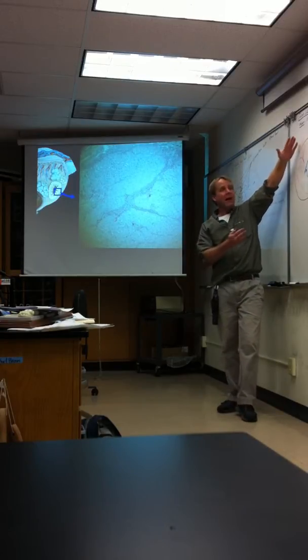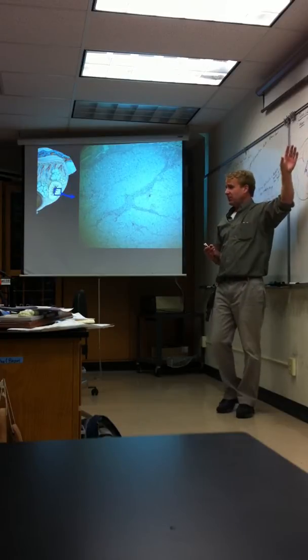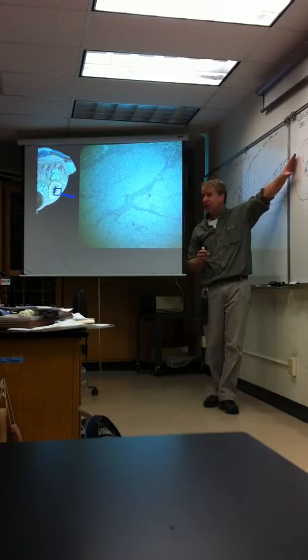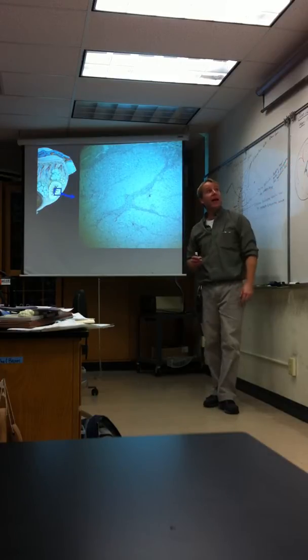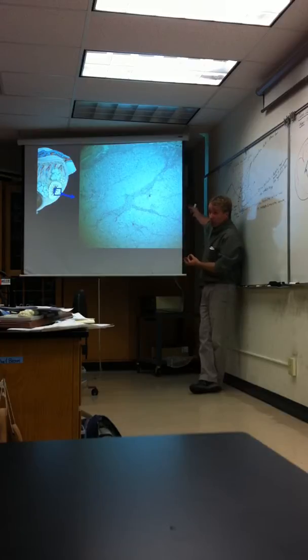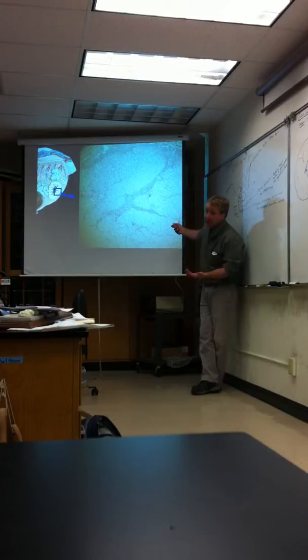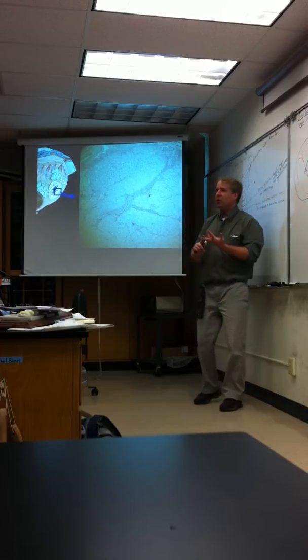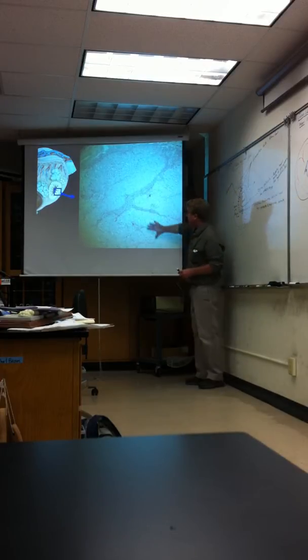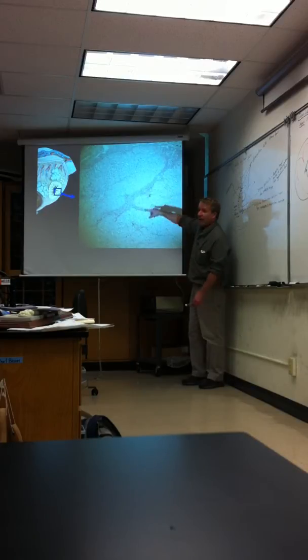With a model or with a microscope, you definitely could be asked questions related to the female reproductive cycle, how the hormones are related to it. And so that is the corpus luteum. So the other question: what is the entire structure filling the field of view? Or the specific structure filling the entire field of view? Corpus luteum. That's a more likely way I'll ask you, rather than the specimen, because for the specimen you could say, well, it's the ovary also. So I like to say, what is the specific structure filling the entire field of view? All of that is corpus luteum.